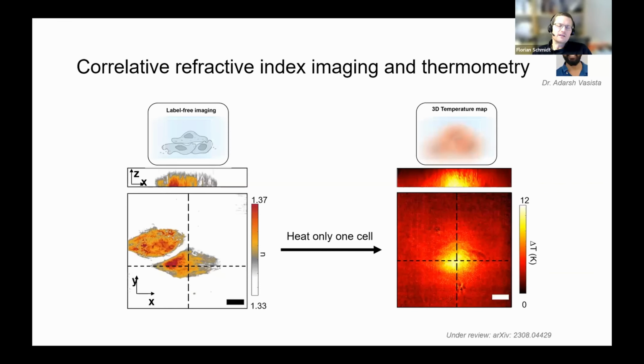Yes. But this is the exciting thing, because you can do systematic investigations of how it looks for different samples and solutions or environments, and how this decay really happens and so on. So that's a very good thing. And in the end, if you don't follow this nice pump probe cycle, the only thing that happens is that when you measure your phase, you have this juxtaposition of heating as well as the system still cooling, right? So it just makes your retrieval a little bit more complicated. We haven't delved into it too much. So we sacrificed the duty cycle a little bit. And that's why I haven't really stressed the time resolution of how fast you can do it. But yes, you're correct.